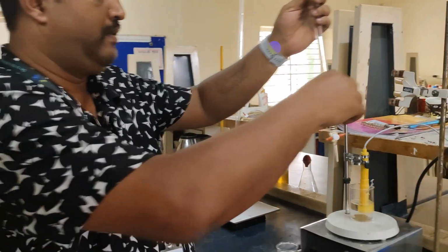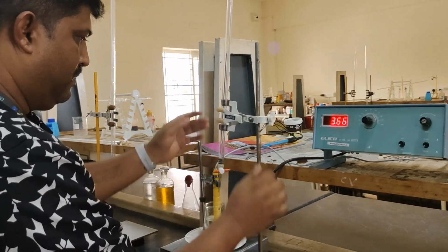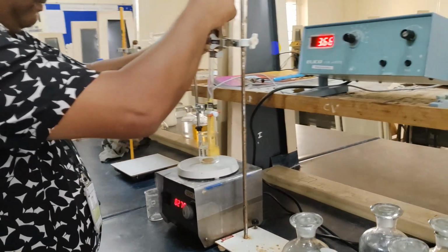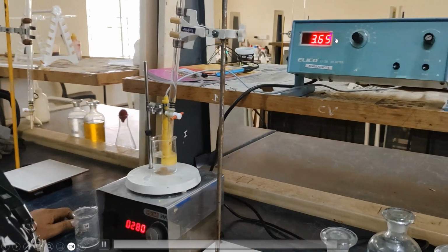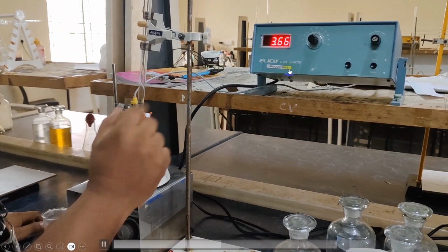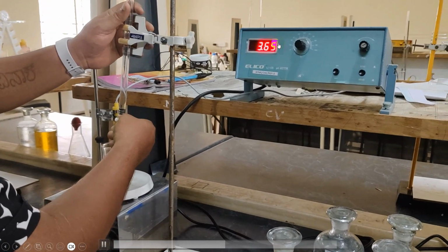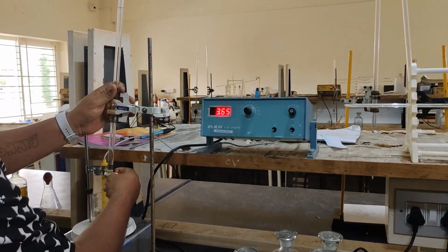Once it is filled, place it back in the holder. Now, before adding the sodium hydroxide, first note down the pH of this weak acid solution, which is approximately 3.65. Now, start adding sodium hydroxide in increments of 0.5 cm3, that is 0.5 ml.